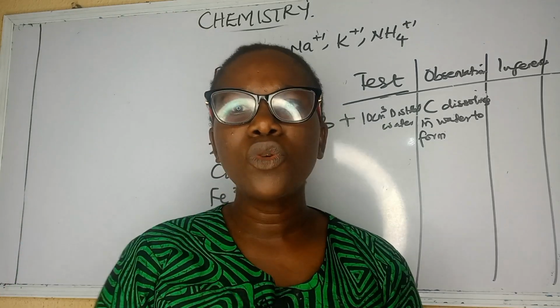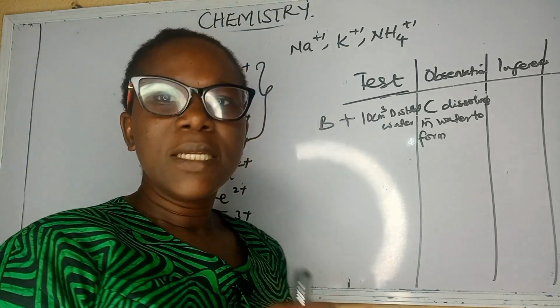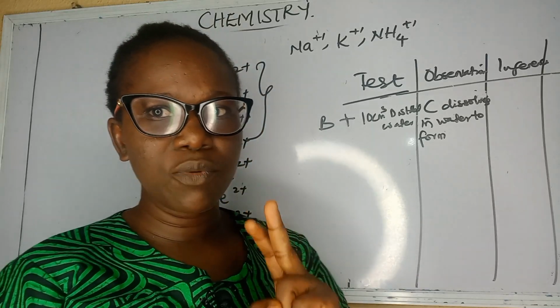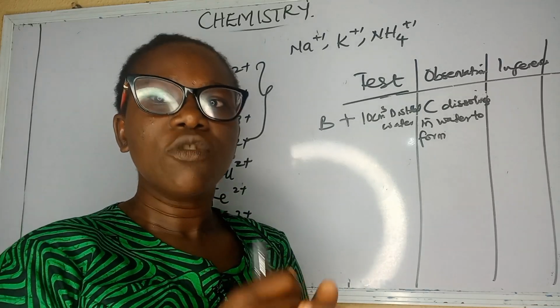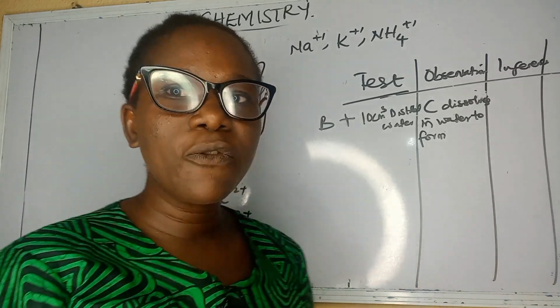Normally, we use two soluble salts. Two soluble salts, when they dissolve in water, will react together. Double decomposition will take place. I'm going to give you 2 examples of salts that we can mix together to form a single compound, and then we'll get 2 different things by the time you filter.